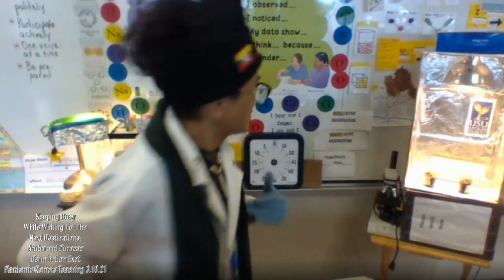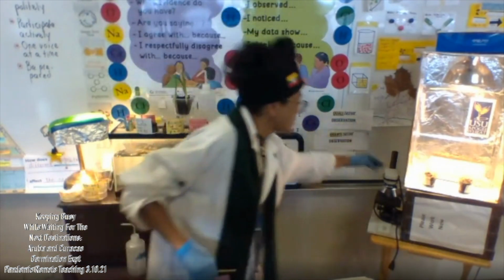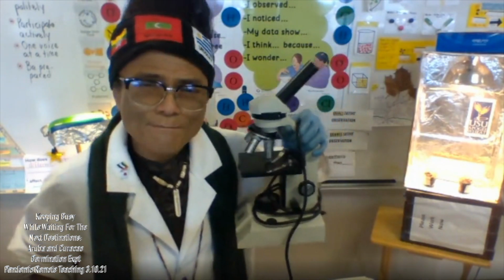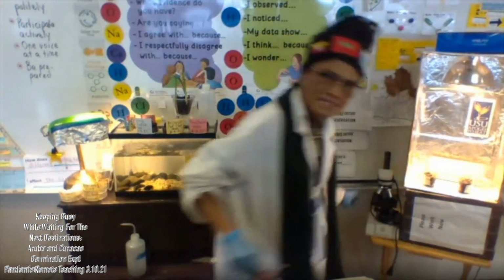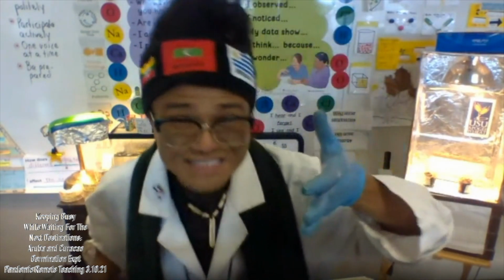All right. So it's a microscope. It's quite heavy. I have several of these, and if you are only here, I'm able to share this with you. You can see microscopic cells under the microscope. Wow. A seed is made up of many cells, lots and lots, and they are microscopic.